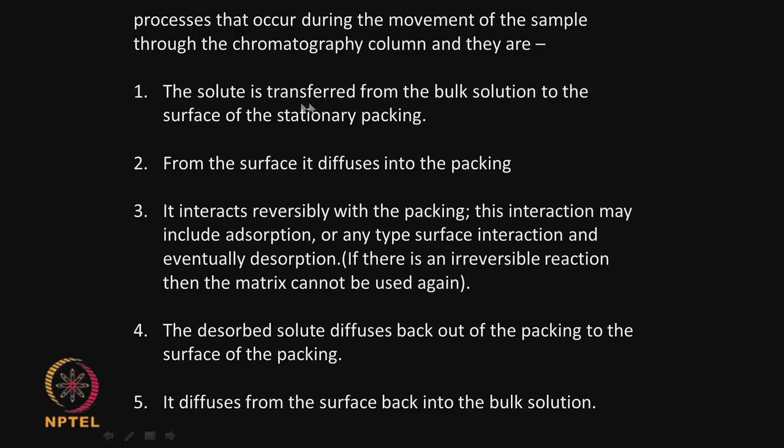So, it is moving from the bulk to the surface of the packing material or the stationary phase. Then it could be getting desorbed from the packing, away from the surface, and moving into the bulk. All these are retarding your solute passage. So, it becomes slower and slower, and the more slowly it moves, the longer the retention time. Each of the solutes has a different retention time, which is why the partitioning of this material takes place.